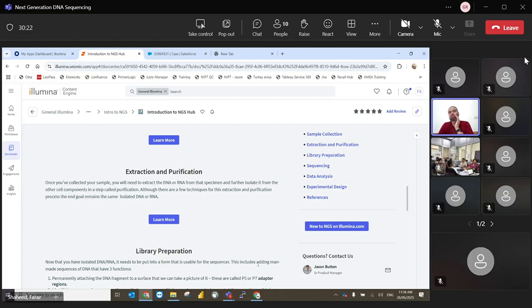These are the three steps you have done, right? So after that, this DNA is still not ready for sequencing. The DNA that you extract from blood cannot directly go into a sequencer and start sequencing, because what is a sequencer? Sequencer is a machine.